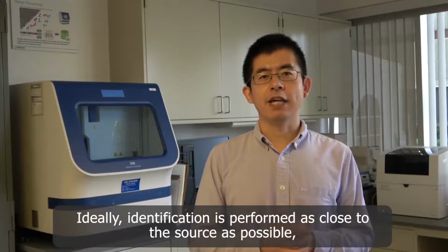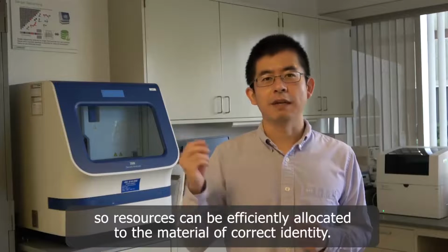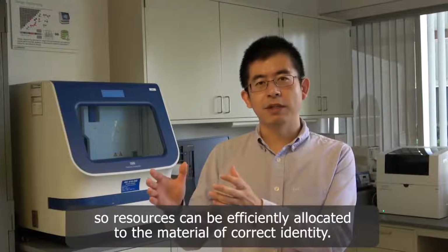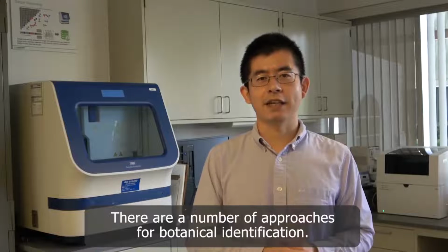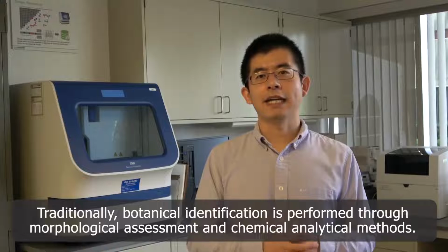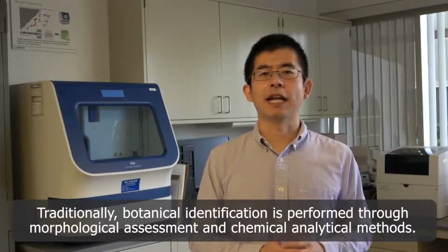Ideally, identification is performed as close to the source as possible, so resources can be efficiently allocated to the material of correct identity. There are a number of approaches for botanical identification. Traditionally, botanical identification is performed through morphological assessment and chemical analytical methods.